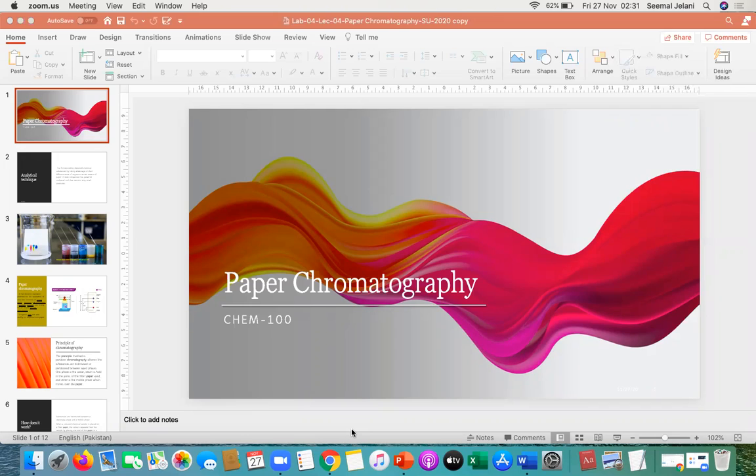So in the last lab with the B section, we did 3 different labs. One was the sublimation of naphthalene. Another was separating the mixture by using the process of sublimation. And number 3 was paper chromatography, how to separate the mixtures of different inks by using paper chromatography. These were the 3 labs and experiments we did on Monday.